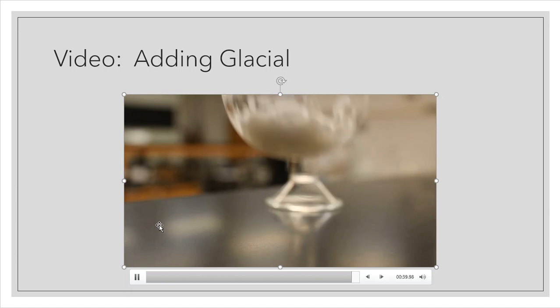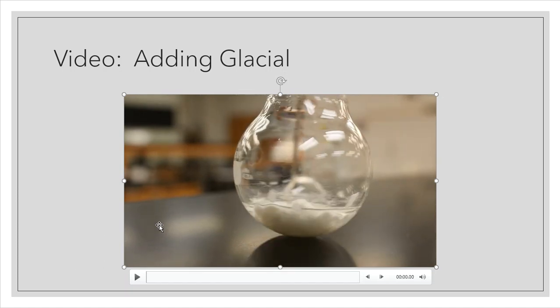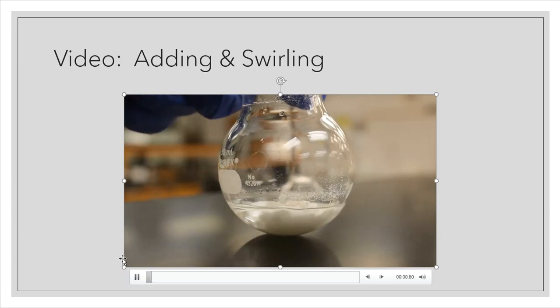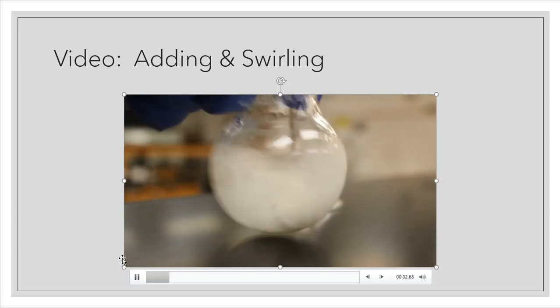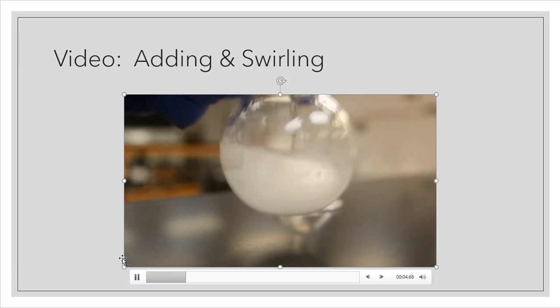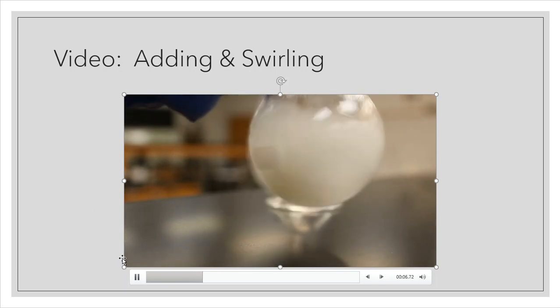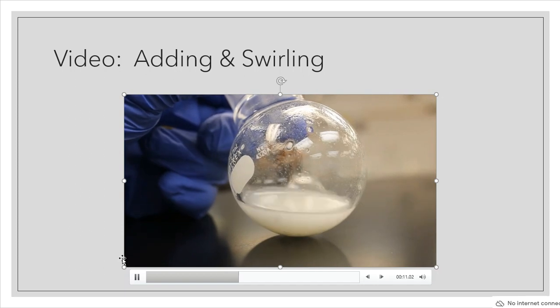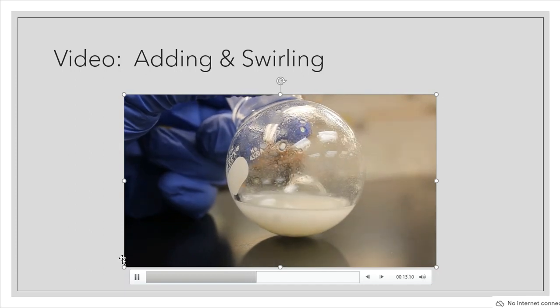I'm then going to take this boiling flask out of the beaker so you can see it, and I'm going to give this a very good swirl, and that's what goes on, folks. Nothing more exciting than that.